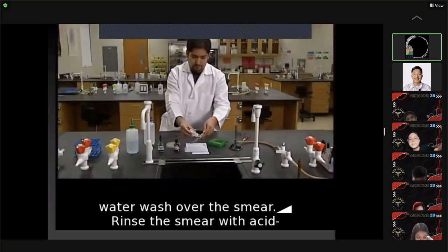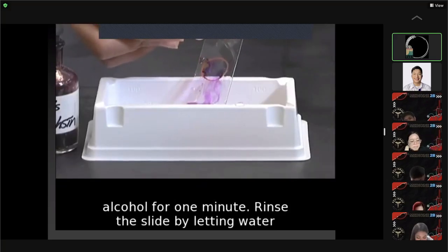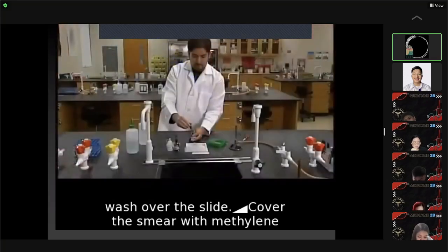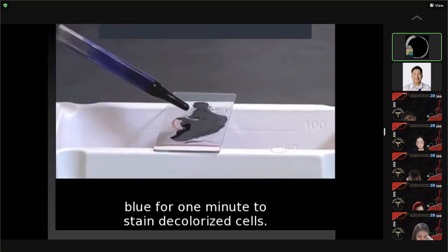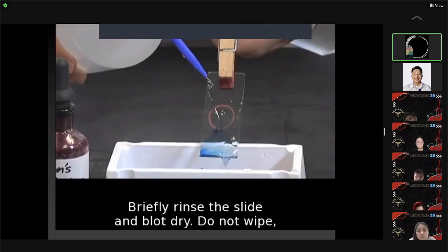Rinse the smear with acid alcohol for 1 minute. Rinse the slide by letting water wash over the slide. Cover the smear with methylene blue for 1 minute to stain decolorized cells. Briefly rinse the slide and blot dry.